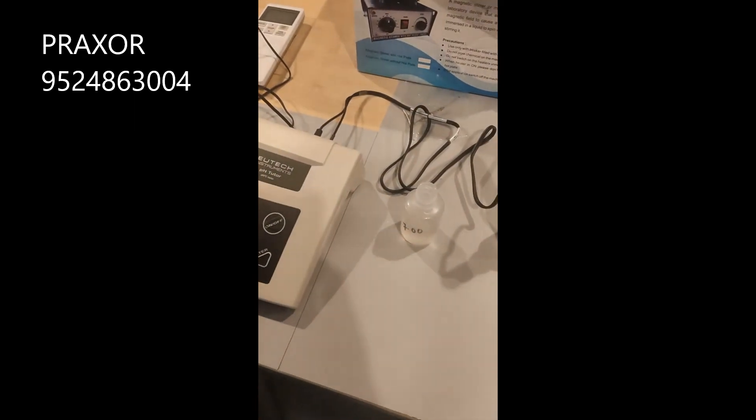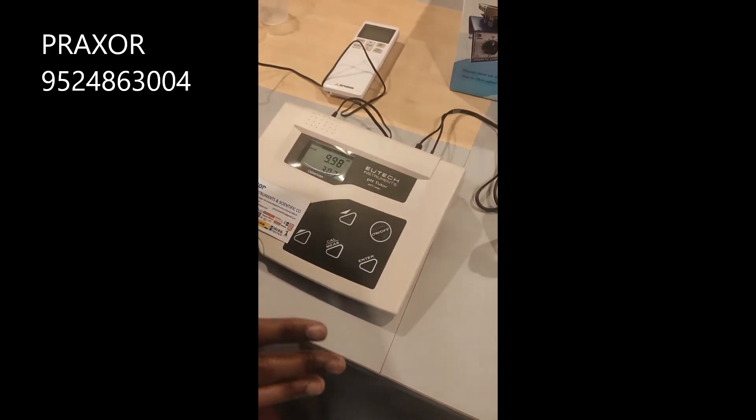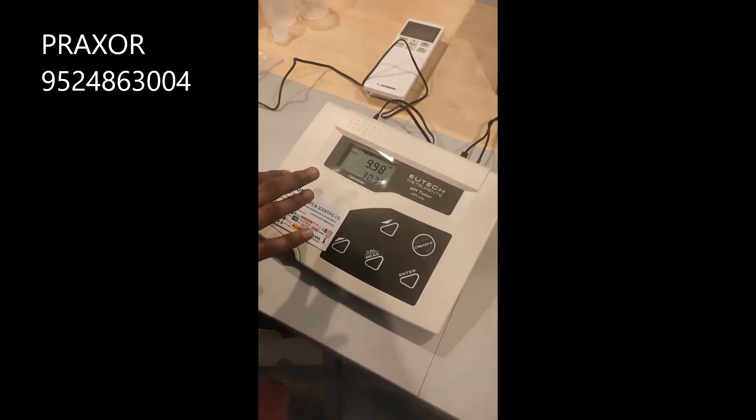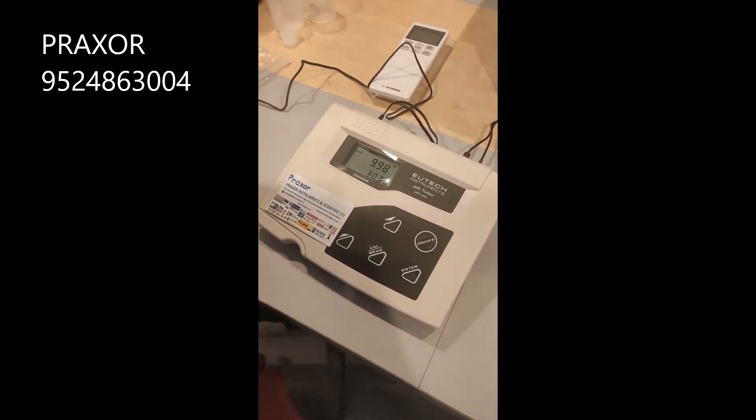After that, take the electrode and dip it in the sample solution. Whatever value appears on the display is the pH value of your sample.